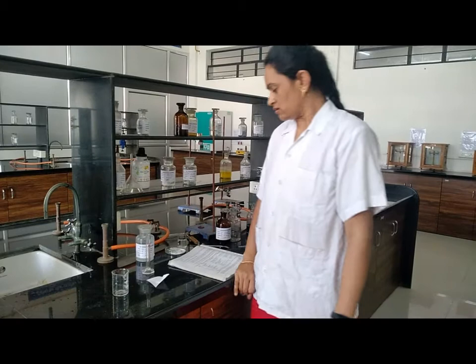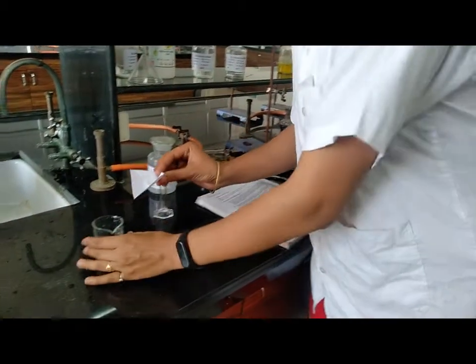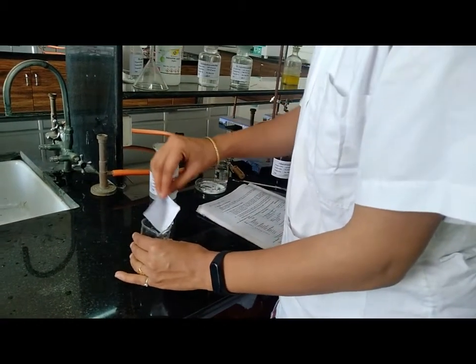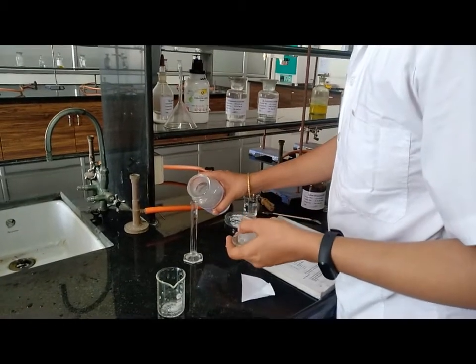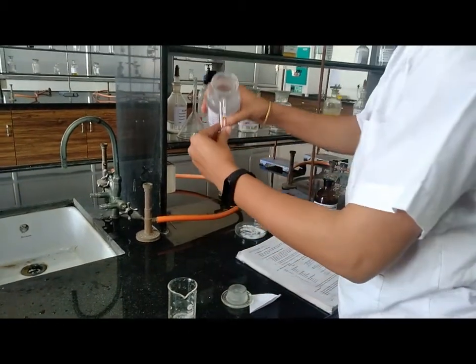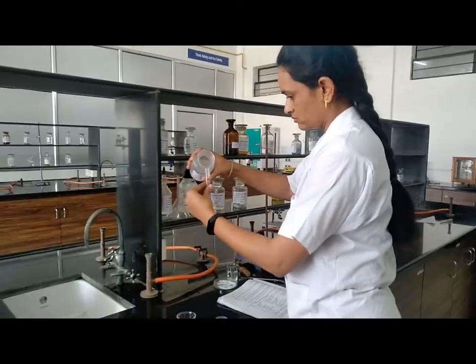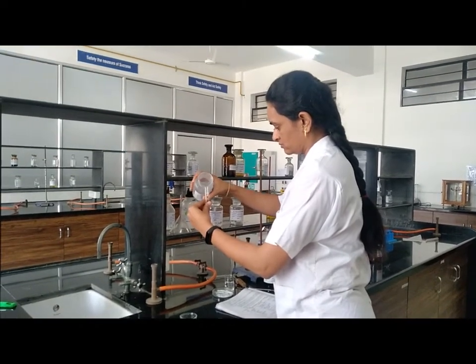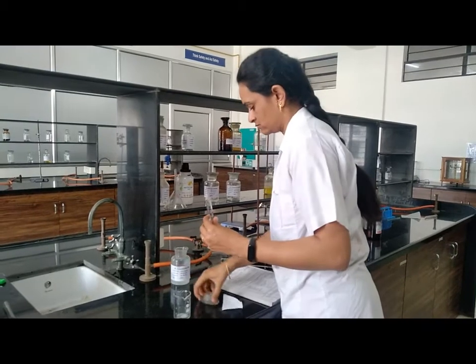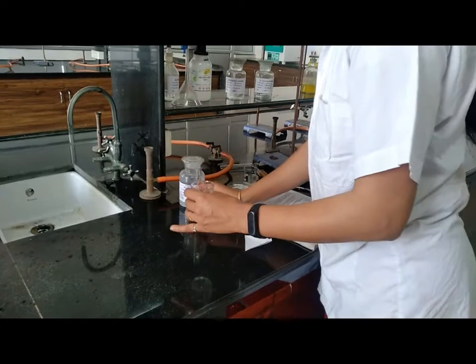First test, boil approximately 0.5 gram of sample, put it into beaker, then add 10 ml of sodium hydroxide solution. Add it to beaker. Then boil this solution for 3 minutes.